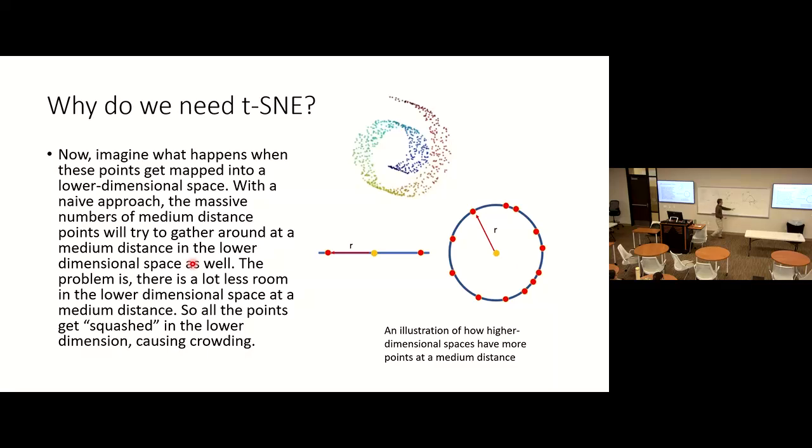So this longer distance gives you more dispersed, regenerated data, okay? It was relatively crowded in higher dimensional space, but when I project onto the 2D, I regenerate the position and put them slightly away from each other. The only slight difference is this region, okay?